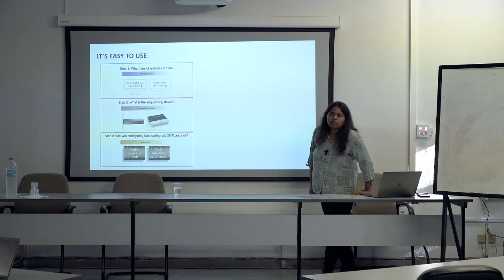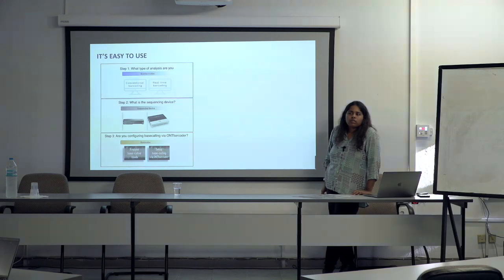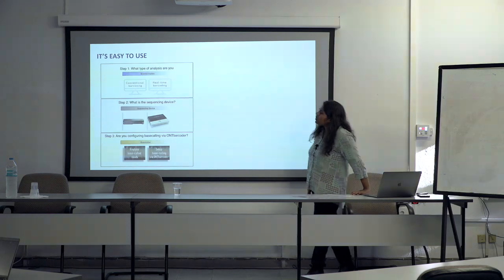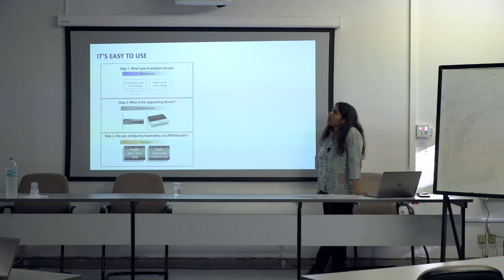The local mutation rate that you get prevents you from saying, use it in ITS1 or use it in 16S? I don't think it's the mutation rate. I think it's simply that our understanding is right now based on CO1.